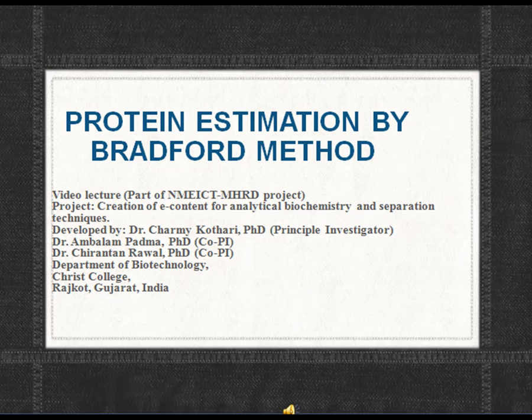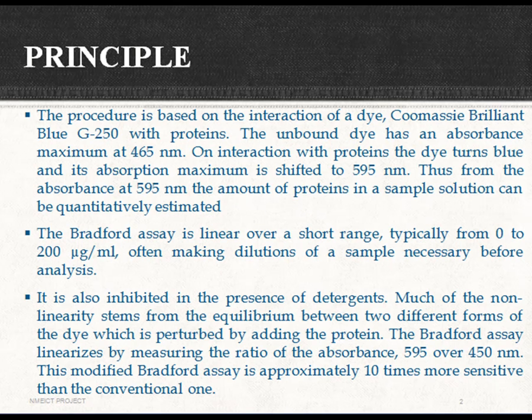The protein estimation by Bradford method. Let's have an understanding of the principle of this method. The procedure is based on the interaction of the dye, Coomassie brilliant blue, with protein.